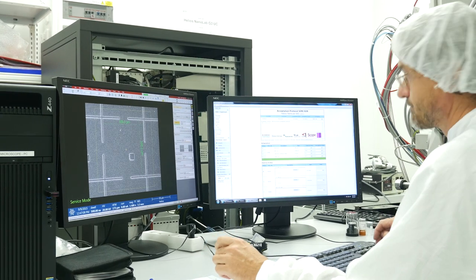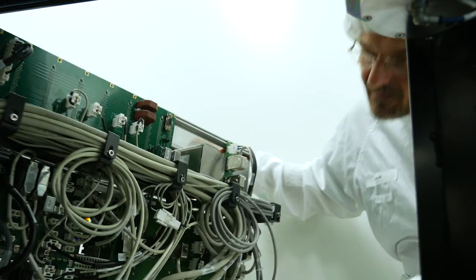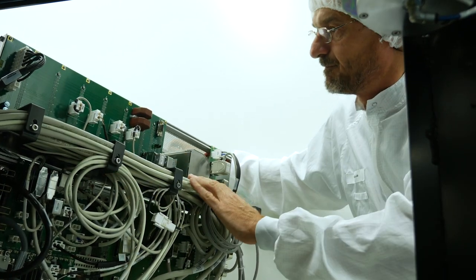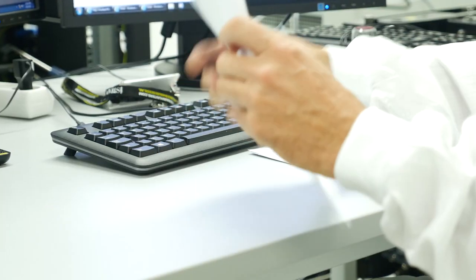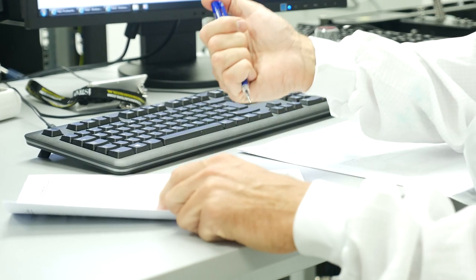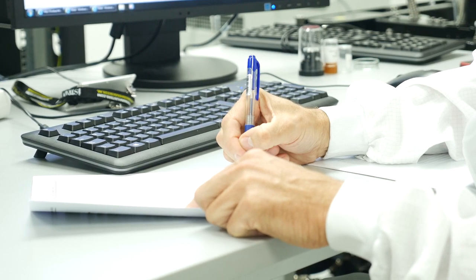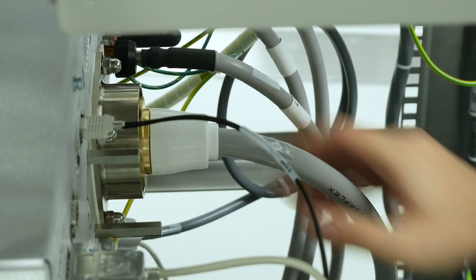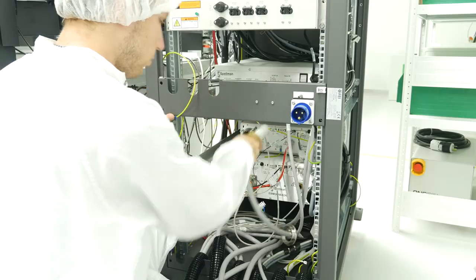Acceptance engineer. Acceptance is an important milestone in the production of the microscope. Not a single value can be outside the limit. Everything must work flawlessly. Well, how is it with our microscope? Is everything okay? Yes, our microscope was very successful. The measured values are summarized in the report, which travels with the microscope to the customer.